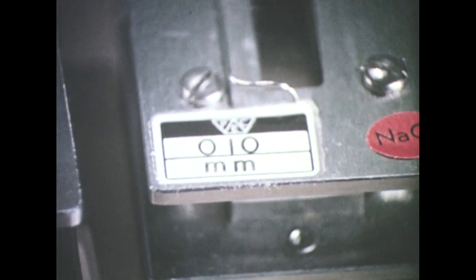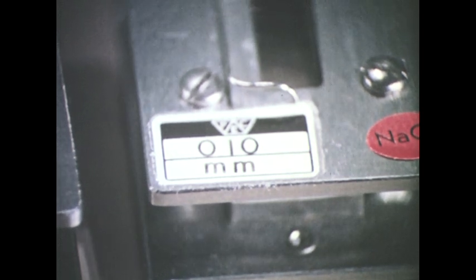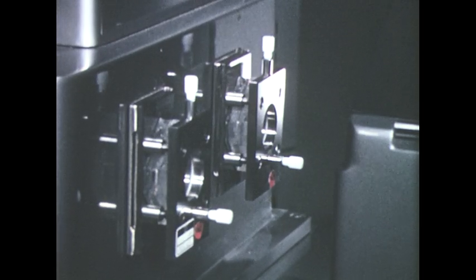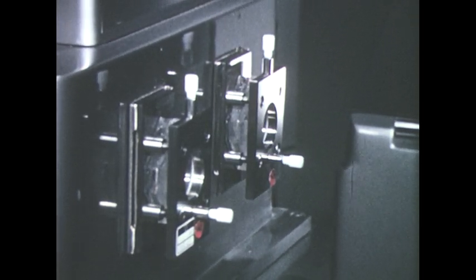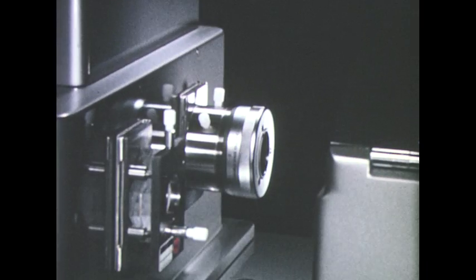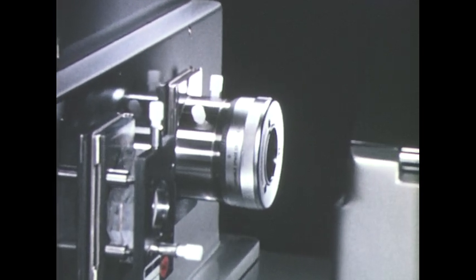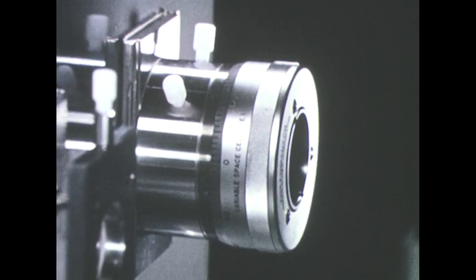These cells are used for both qualitative and quantitative work. To cancel out the solvent absorption bands, matched cells of identical thickness are placed in the two infrared beams. With this ingenious cell, the optical path can be continuously varied until perfect cancellation of the solvent bands is achieved.